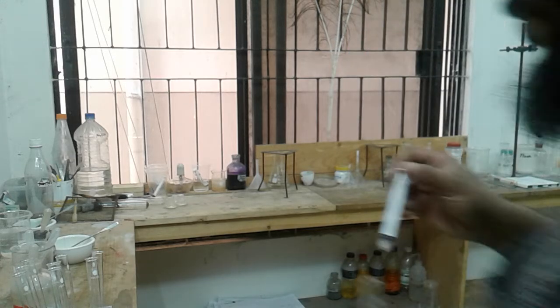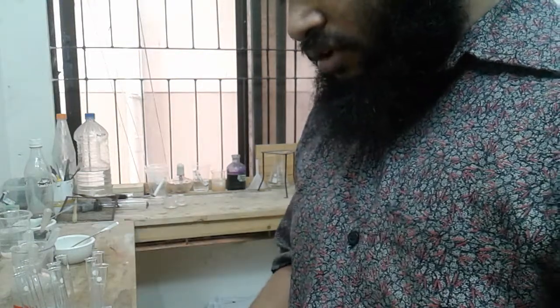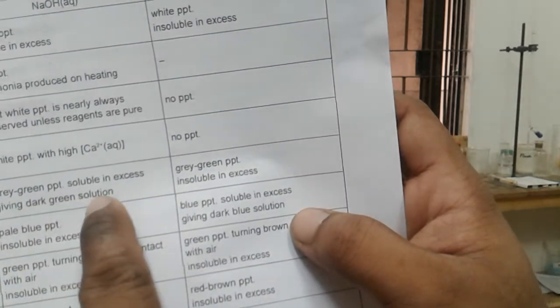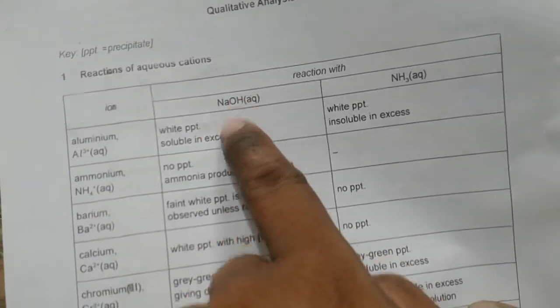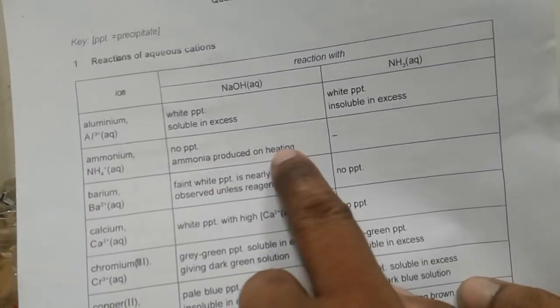Okay, so if you look at the data analysis table, look at here, a green precipitate formed which is soluble in excess, giving a green solution or dark green solution, whatever it is. So it will be chromium. And look, just a few moments ago I said, if you just add sodium hydroxide, there will be no precipitate of ammonium, but when you are heating, it will produce ammonia gas.